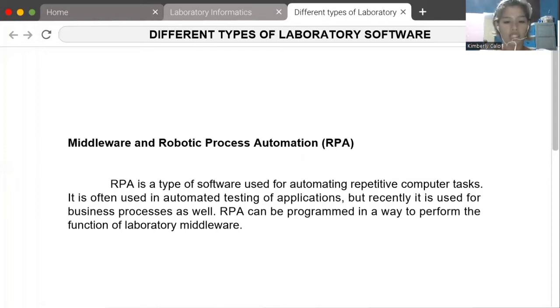The benefits of this, besides higher efficiency, include maintenance of data integrity throughout the whole process, which eliminates the need for additional integrity reviews.